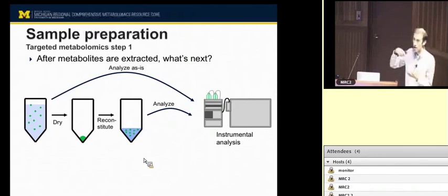A lipid like a free fatty acid is not going to be too favorably solubilized by water or a salt solution. But methanol is another story. So it's actually much more soluble there. So a lot of the times that organic solvent will disrupt the interaction between your hydrophobic metabolite and bring it into solution, while precipitating your protein.